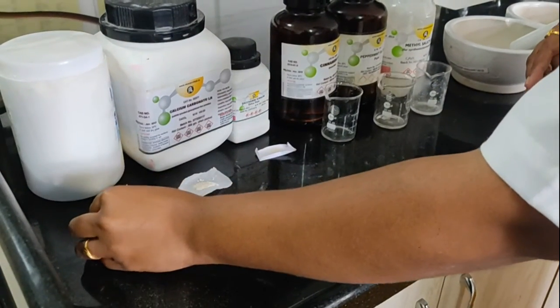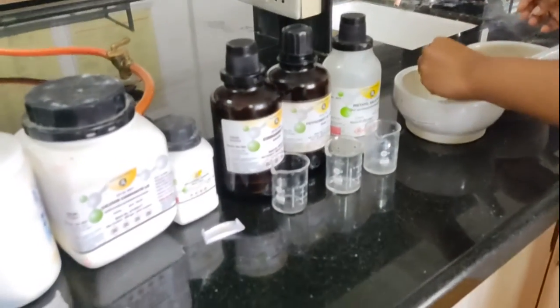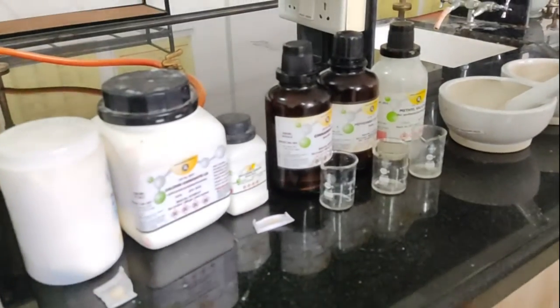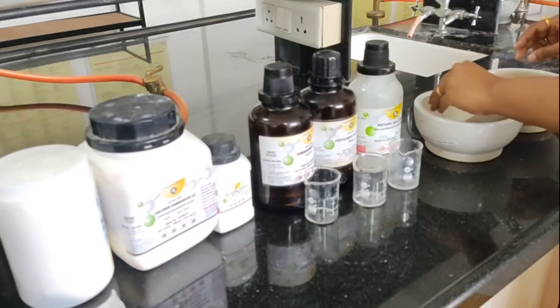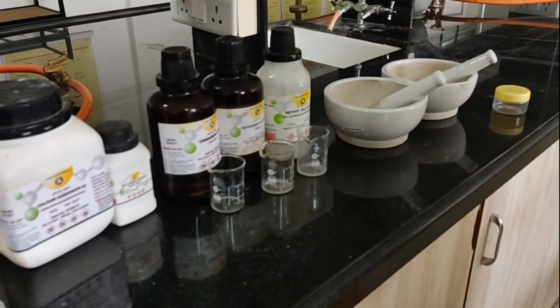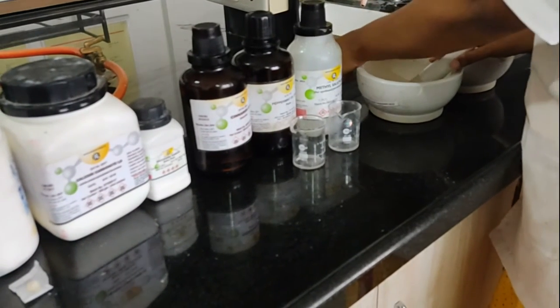So first of all, I am going to take the calcium carbonate into these two mortars. Then, after this, I am going to take the saccharin sodium into these two mortars. Then the next addition is of the volatile oils: the cinnamon oil is added into the first mortar, and simultaneously it is added into the second mortar.